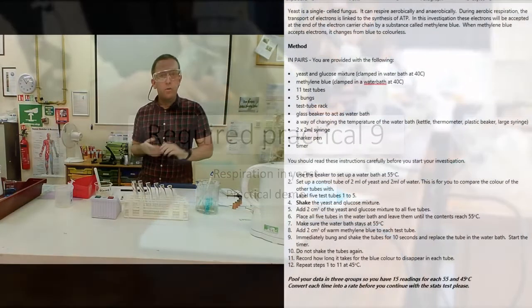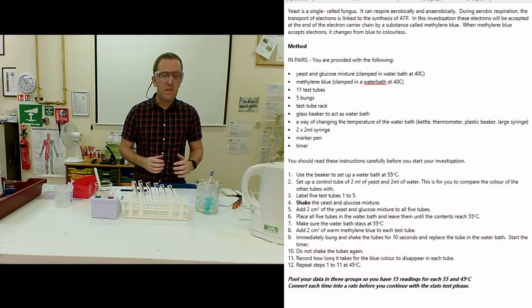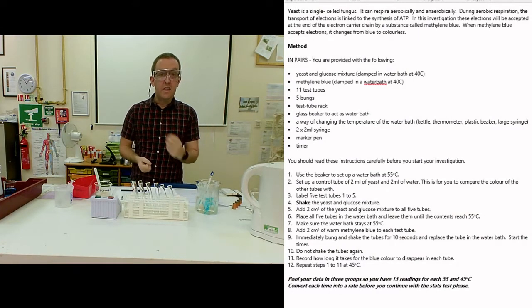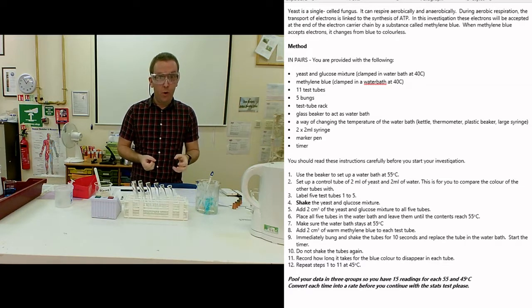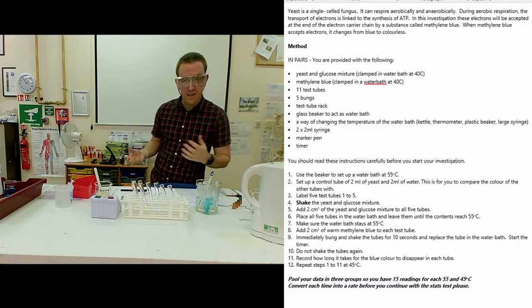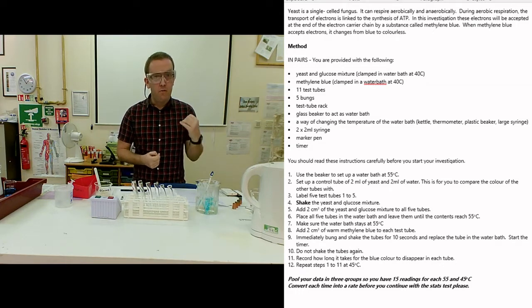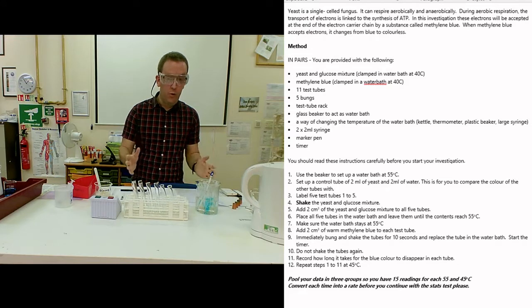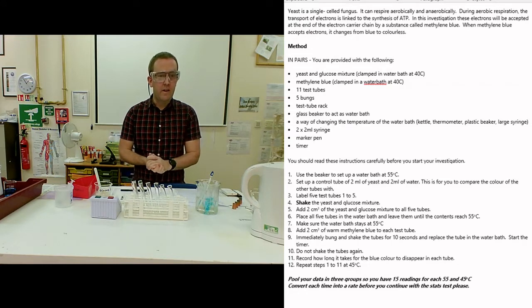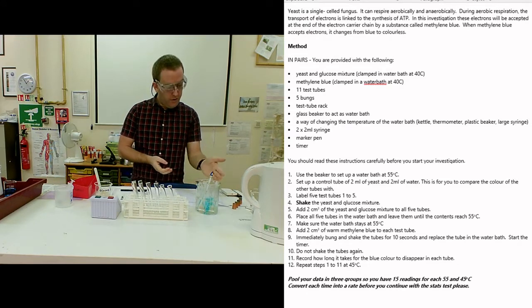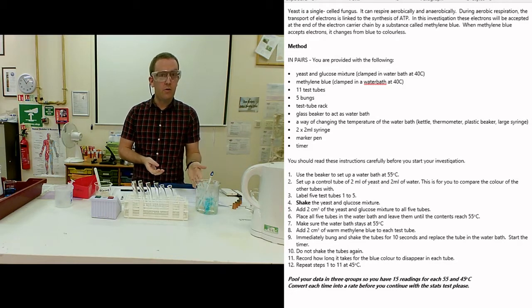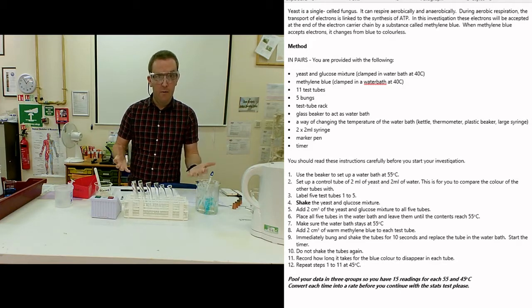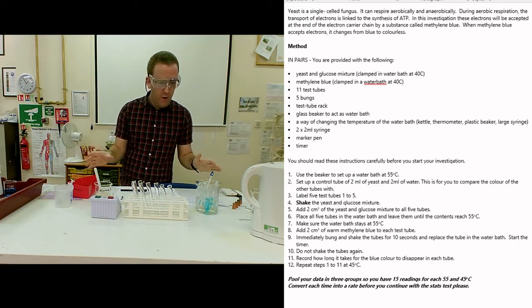Hello and welcome to this video demonstrating Required Practical 9, which is yeast and its activity decolorizing methylene blue. It's a respiration practical where we're assessing how quickly electrons generated from respiration in yeast can decolorize methylene blue. I'm going to do exactly what you would do in the lab, following through all these instructions which you can see on the screen beside me. First thing, I've got everything I need set up nice and neatly.